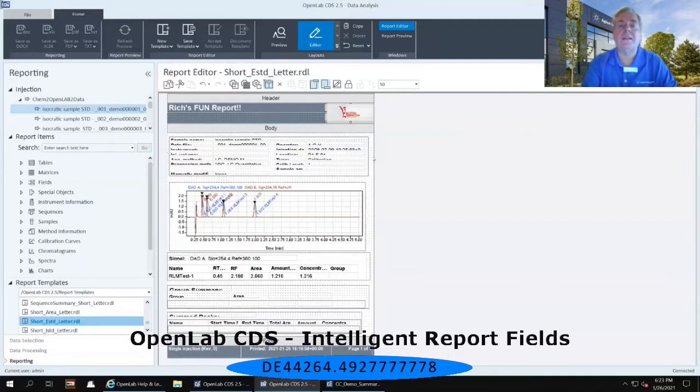one of these virtual images that I've given you access to on Agilent's cloud is not the highest resolution it really should be. You're not going to see this type of resolution on your high resolution monitors sitting in your laboratory. But again, because we're in a virtual environment on Agilent's corporate cloud, it is going to shrink that resolution. And so that's why it kind of looks like things are kind of cut in half on this.